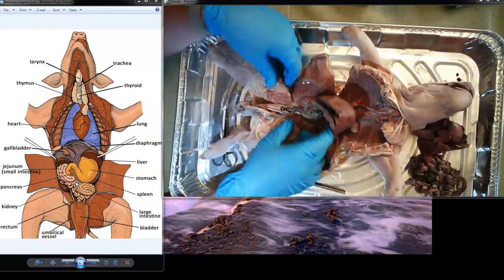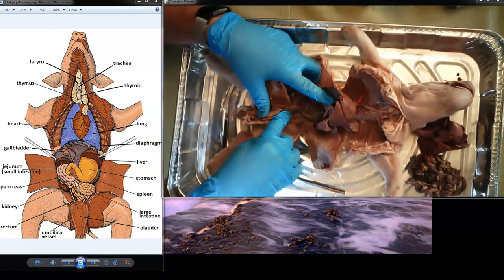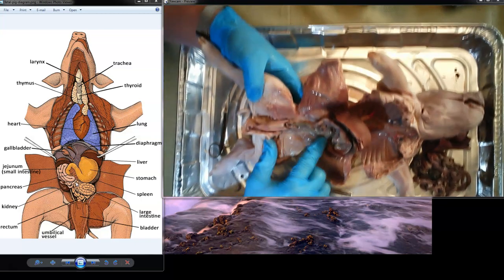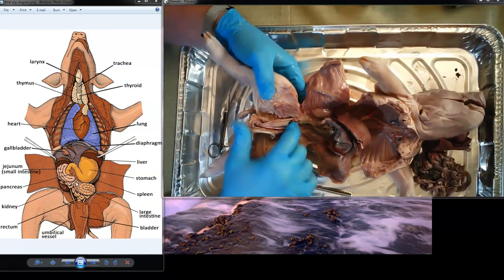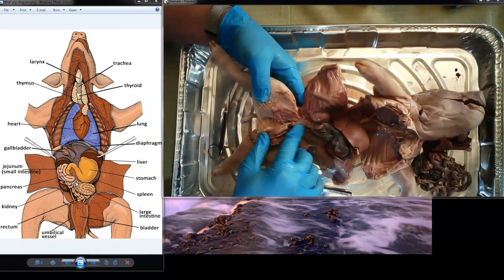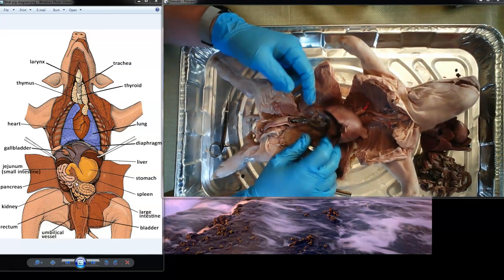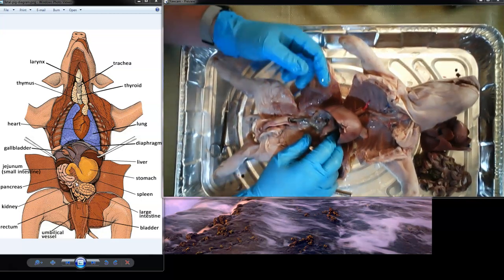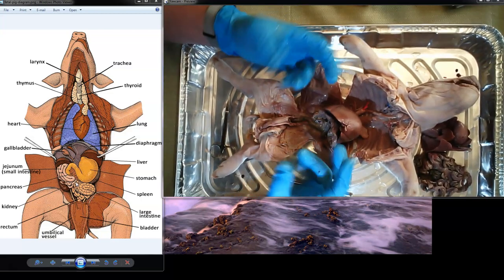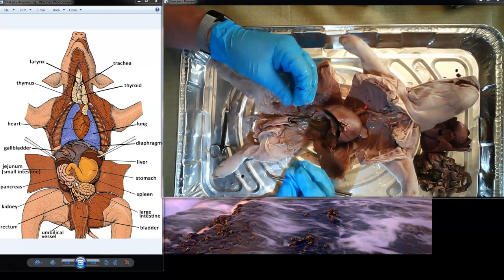Okay. So next, now we have here the bottom end of the large intestine. So that's this right here, and that takes us out of the pig with the rectum and then the anus. And so these pigs, as they live inside their mother for the few months that they live, they don't eat anything in terms of food, but they do move their mouths open and closed, and they swallow every once in a while.